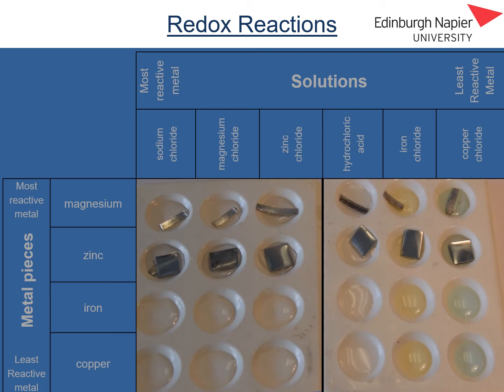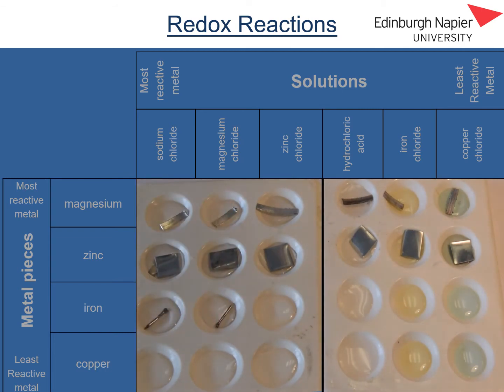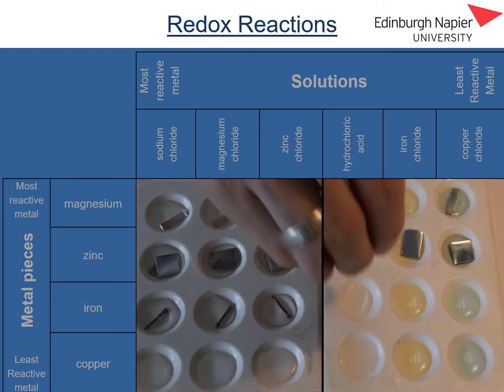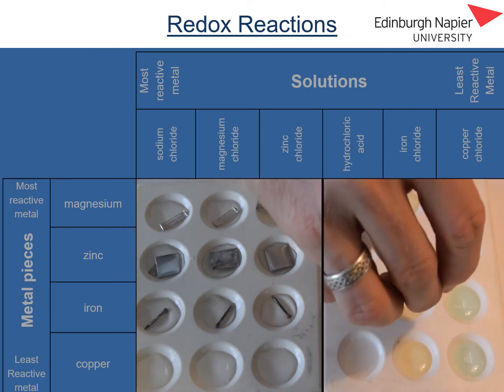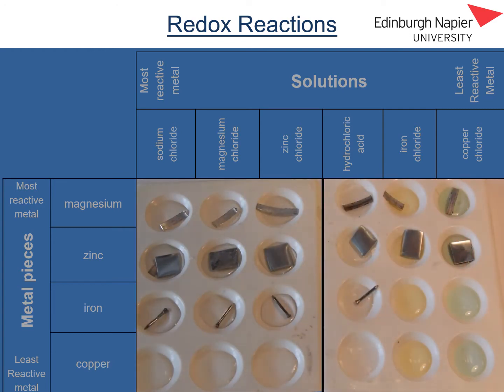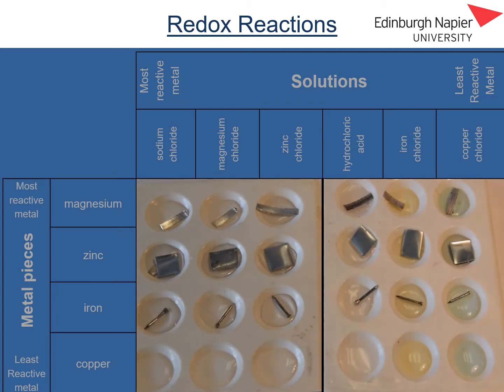In the next row I'm going to add some pieces of iron. I'm adding iron to the sodium chloride solution, to the magnesium chloride solution, to the zinc chloride solution, to the hydrochloric acid solution, to the iron chloride solution, and to the copper chloride solution.